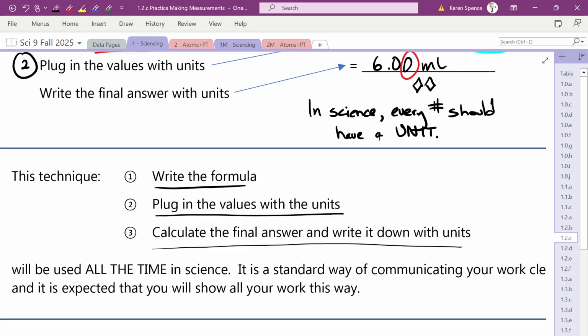I did a terrible job with these instructions. There's no mention of a beaker for the water. Use a beaker for the water. I have to rewrite this.